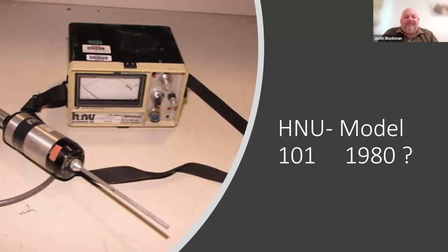It was bulky. It had a large analog gauge, so accuracy no better than 7 or 8%. It was fixed to 3 very basic ranges. However, it did its job. It was the start of the PID industry. It sold well. It sold very well, actually, for all of those original Superfund jobs. It did very well indeed.